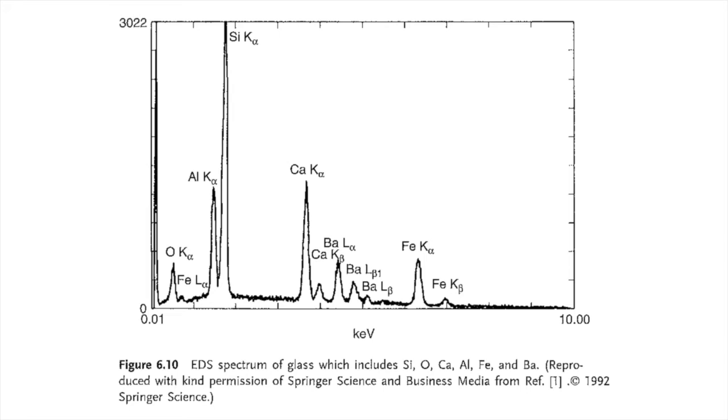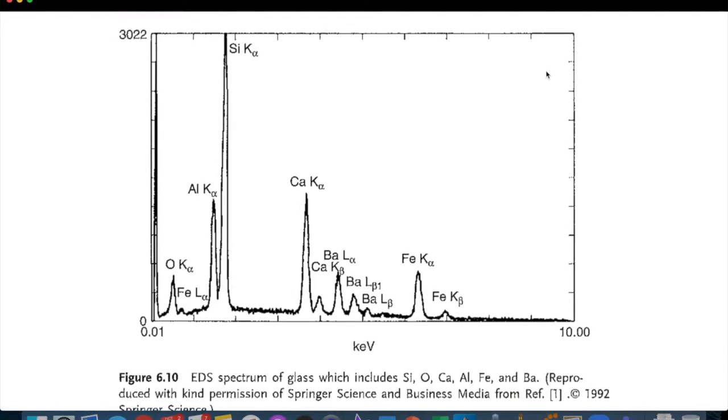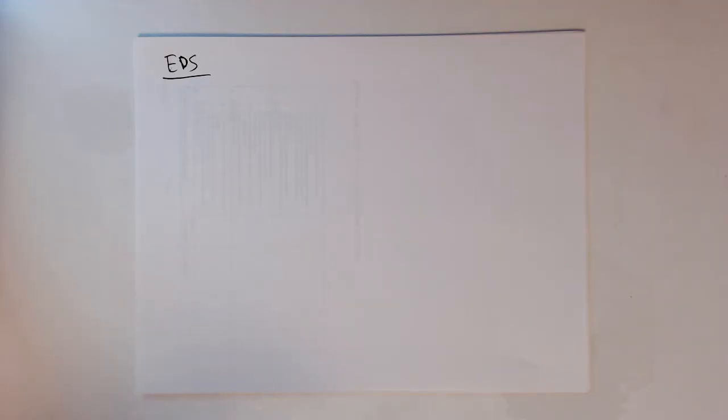One thing connected to this is what we refer to as the dead time. So let me switch over and write this out for you. All right, so due to the design of these detectors, if we emit too many X-rays to the detector, it basically gets saturated, and so we can't detect more and more X-rays.